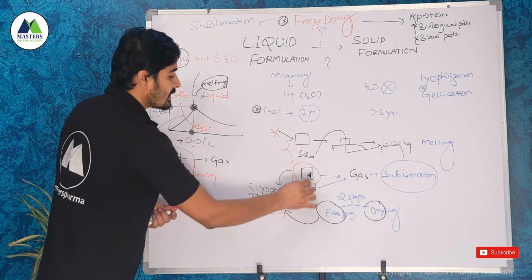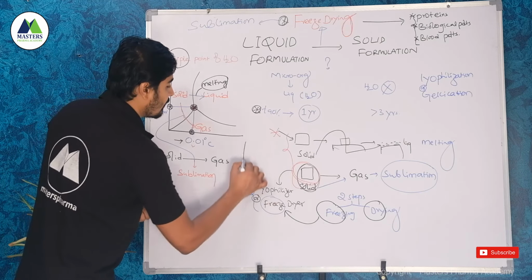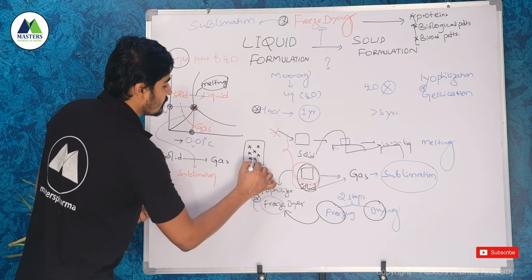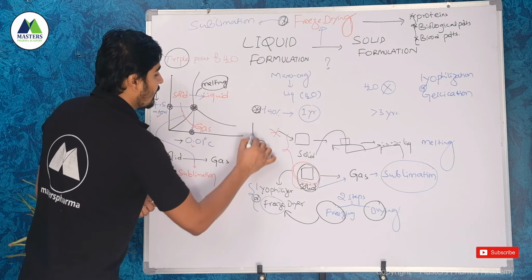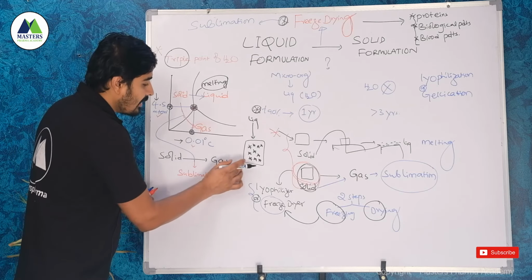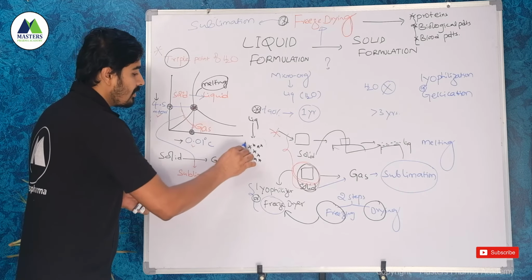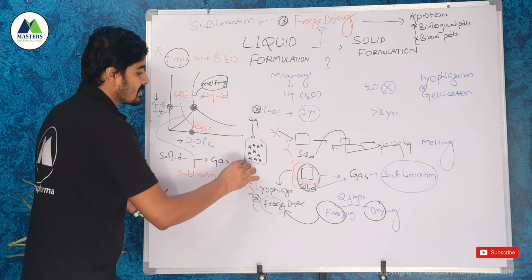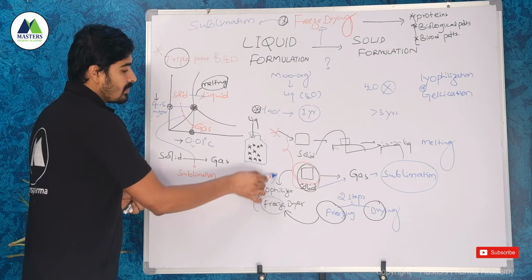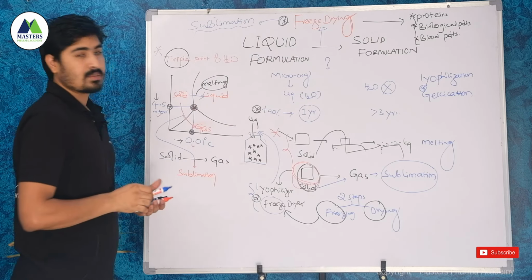In the freezing, we will get this kind of solid structure, ice along with the drug substance entrapped in the ice. Our drug substance will be entrapped inside the ice like this. The liquid formulation is converted to this kind of formulation, right? From this, the solid slowly evaporates as a gas. So now only powder will remain inside the glass. So now the liquid is converted to the powder in the lyophilizer because of this freeze drying process, the principle is sublimation.